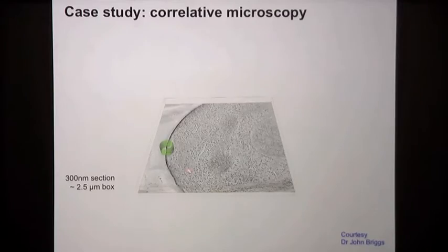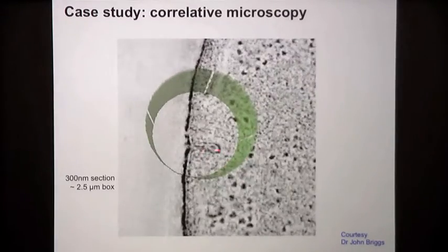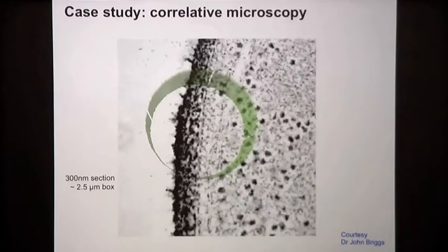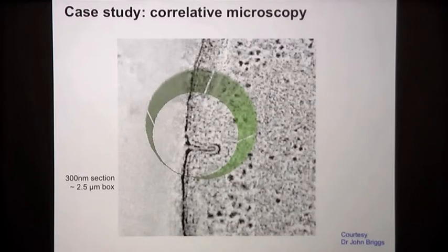And in the tomogram, you can clearly see it's a yeast cell, and this is an endocytic site. And this same thing you can do for many different states and define a dynamic process which is occurring in cells by the use of tomography.